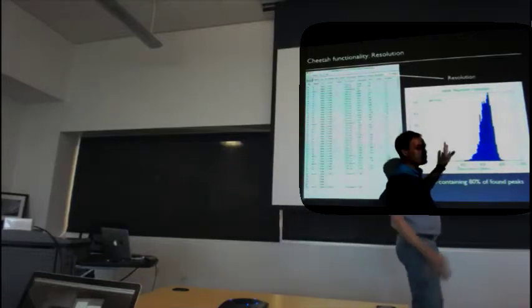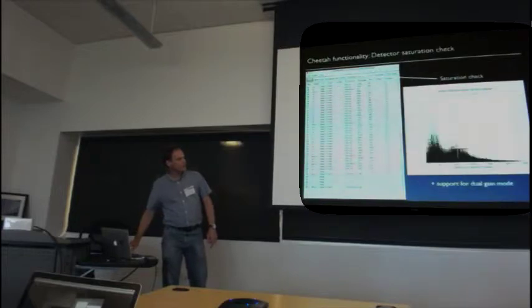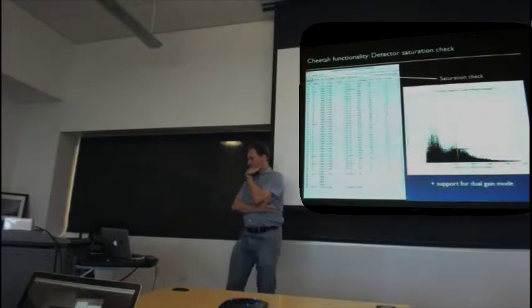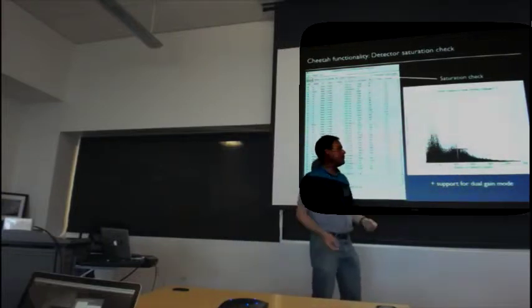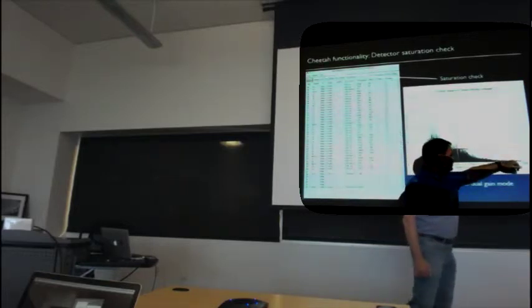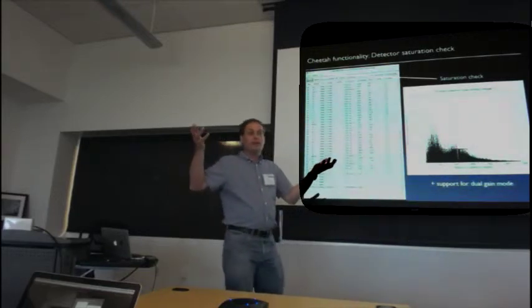You can also sometimes get quite different distributions. It gives you some idea of, on aggregate, what my diffraction looks like. This is a useful one, it turns out: saturation. The CS pad detector has a maximum full well capacity of about 2,500 photons, and Wilson B factors exist for a reason. It's very easy, if you want to detect your high resolution peaks out here, to saturate the detector at low resolution. If you saturate the detector at low resolution, you know that the intensity was above some value, but you don't have any idea of what it is.